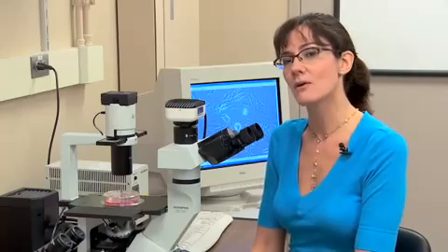One of the points we try to introduce to the students is that if we change the environment the cells are in, the cells will change, produce different proteins, and possibly create an entirely different tissue. One of the experiments we conduct in this lab is to take fibroblasts, the cells that are in the dermis of the skin or the tendons of the body, and we feed them caffeine, sugar, and fat, basically coffee and donuts, and then the cells will change into adipocytes, the fat cells of the body. This is just one of the many experiments we conduct to demonstrate the concept of differentiation in cell culture.